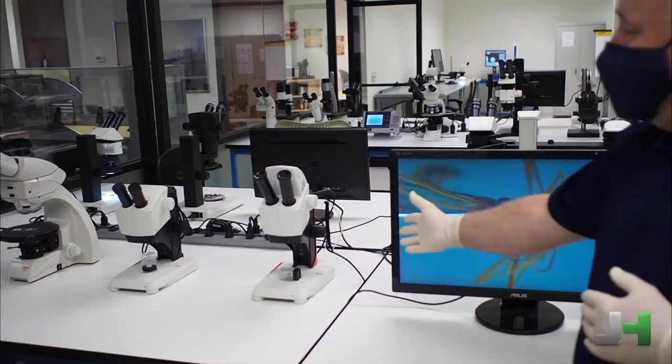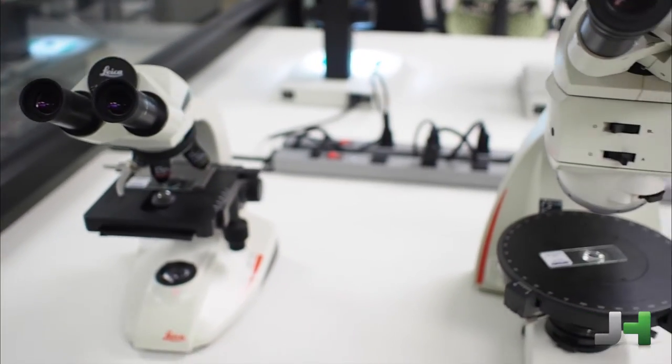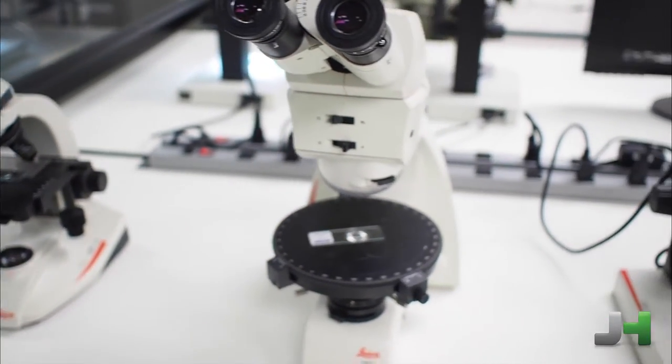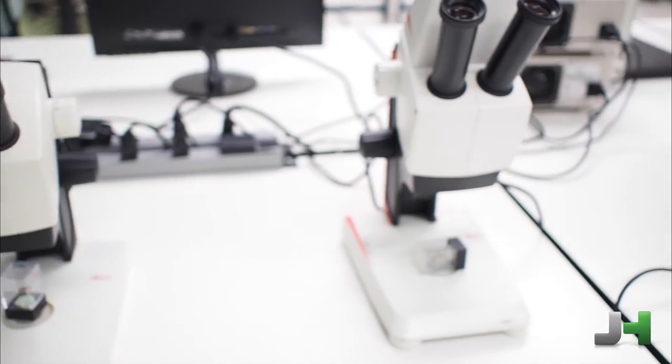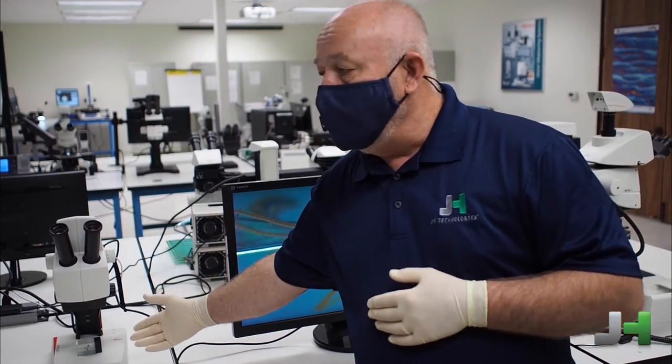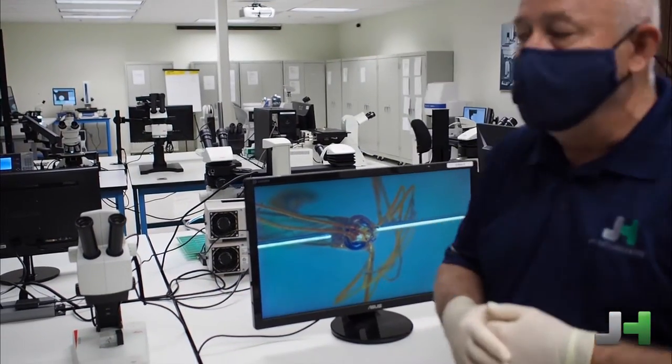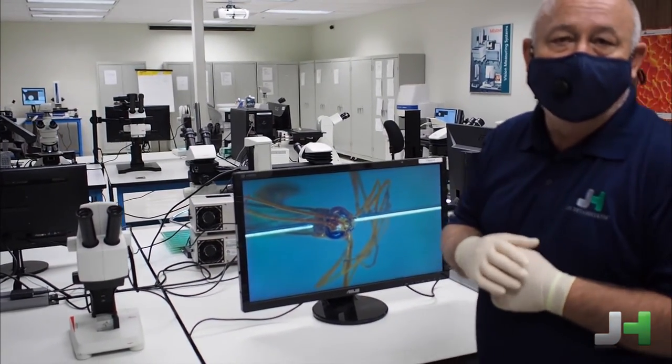Over here, we have education tools. It's primarily for the four-year, two-year institutions, for biology, for petrology, and then just general instrument use in other sciences as well.